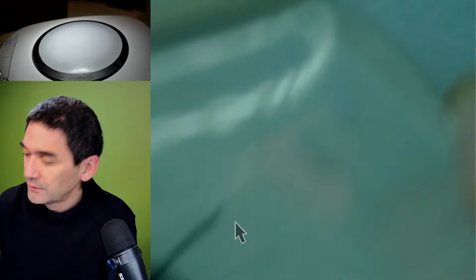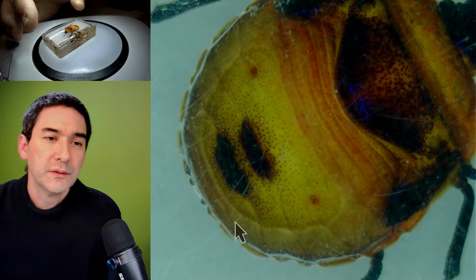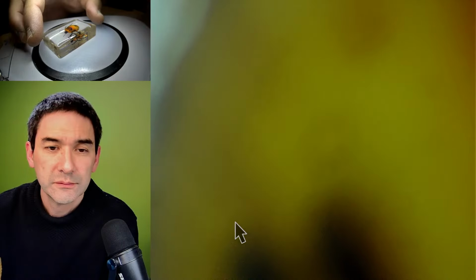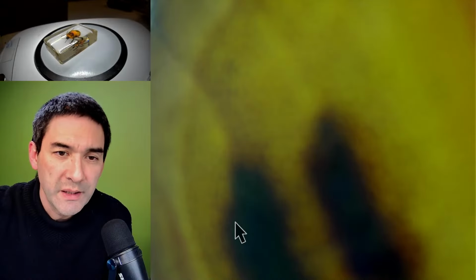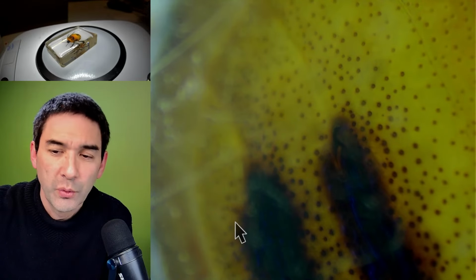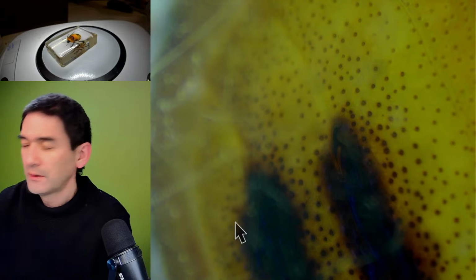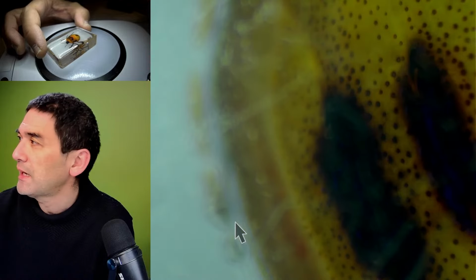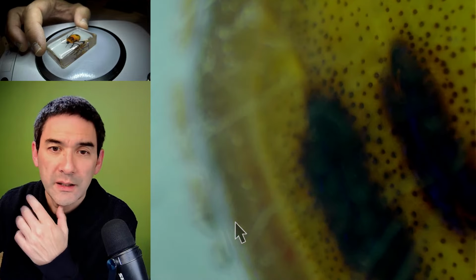This one over here. It's also quite a nice one. It's going further. I should probably readjust my camera a little bit so that I do not have to refocus all the time. Okay. Yeah, and you have to keep the filter near the camera. In my case, I've got an HDMI camera mounted on the photo tube, and I've got a ring light on the surface.